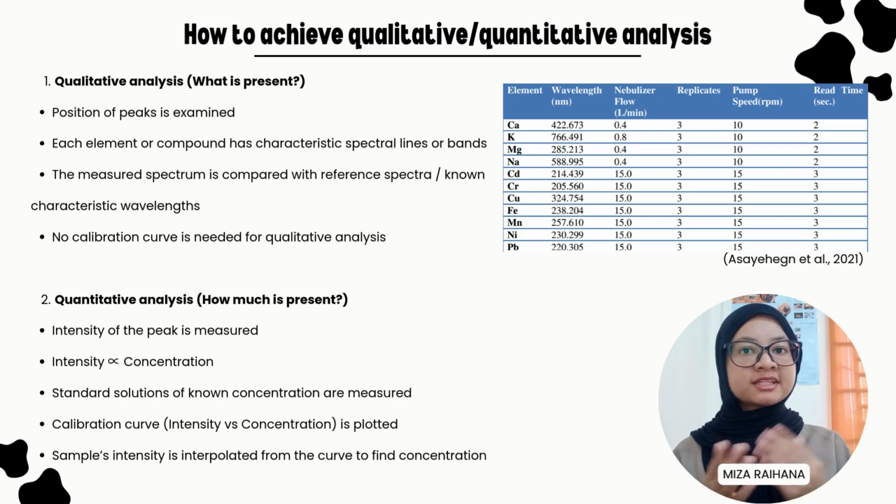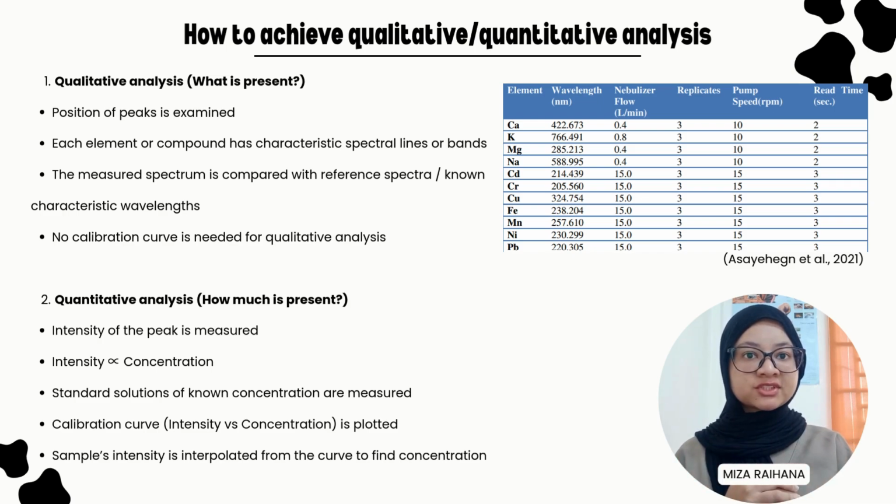Secondly, quantitative analysis focuses on how much is present in the sample. The signal intensity is proportional to the concentration. The sample's intensity is interpolated from the calibration curve to find the concentration.